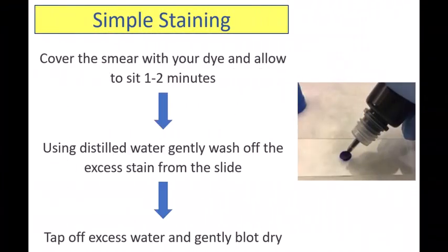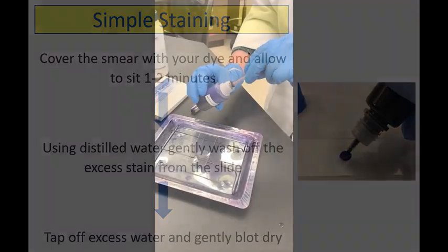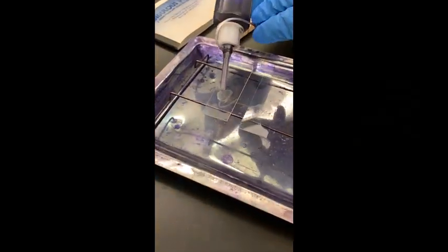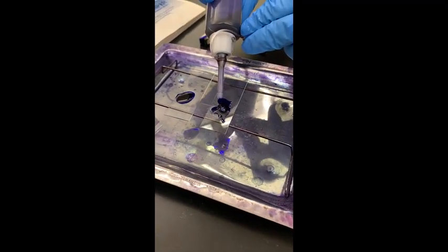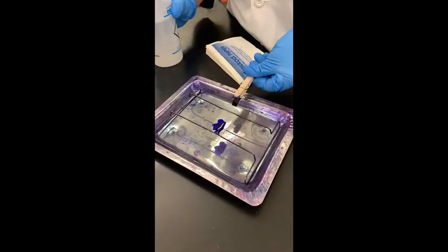Now for the actual staining. Cover the smear with your basic dye. I'm using methylene blue today. Allow that dye to remain on the smear for one to two minutes.